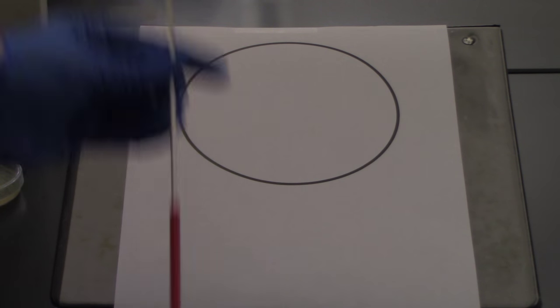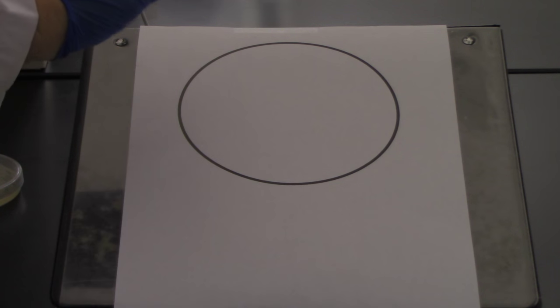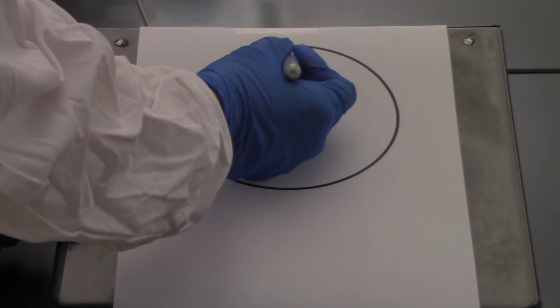I'm using a loop, but I'm going to draw here — we're going to pretend that the Sharpie is acting as our sterile loop. I would pick up a little bit of culture, come over to the plate, and make about a one centimeter smear on the plate.